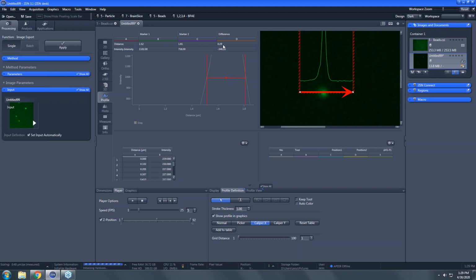So why is that important? Why did we do it that way? Well, you can imagine if we did an exposure time that was half of what was done to collect this data, so that the intensity was half, then when we go to look at this plot, the maximum intensity will be 1000, the half maximum will be 500. If we measure the full width at that half maximum of 500, we should find out that the bead is still 290 nanometers.